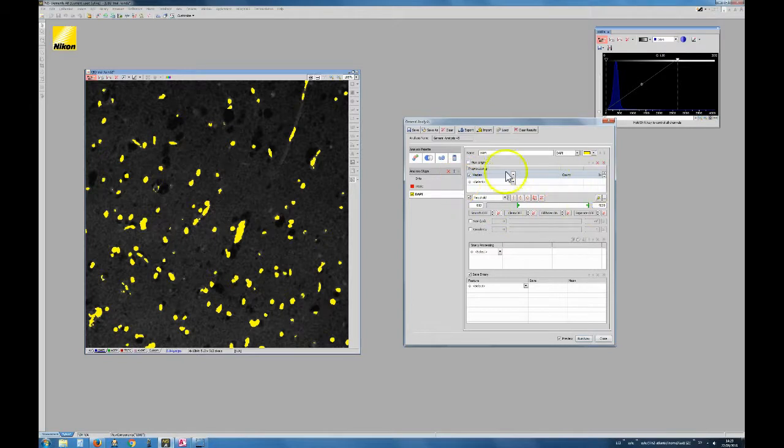So now we have done some pre-processing and some thresholding. We could, for example, filter out all the small bits that we don't want, or the long ones or the very big ones. So if I go here and say filter objects, I can filter based on the size. I say fill area and I get my histogram. I'm going to remove the big one. Yeah, that is maybe not what I want. And I also maybe remove the tiny ones. So all the small ones go away. Okay, let's say that we're happy with that.